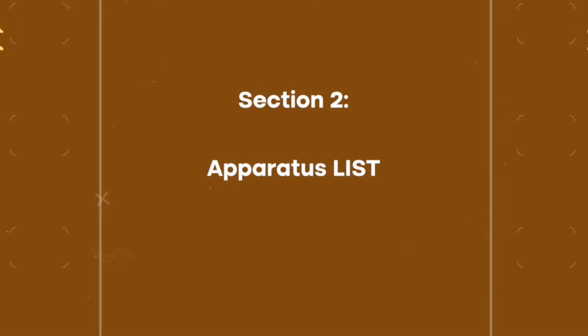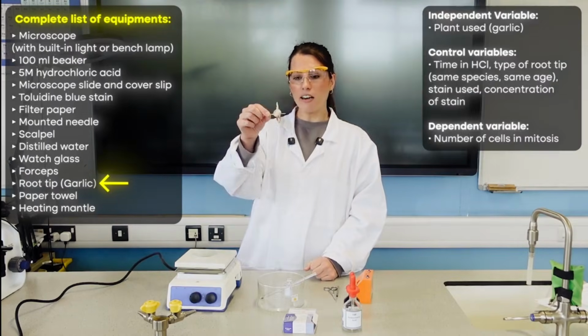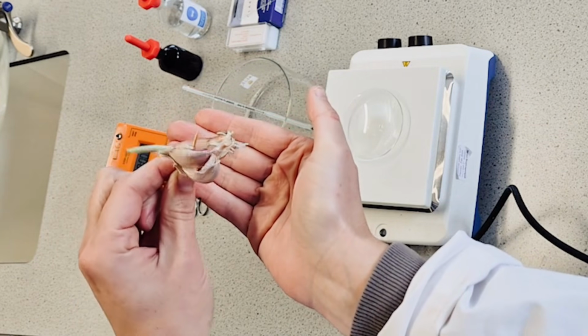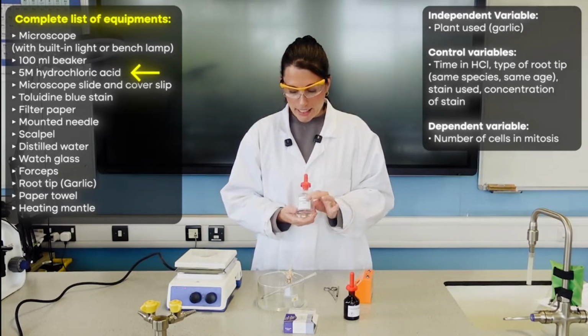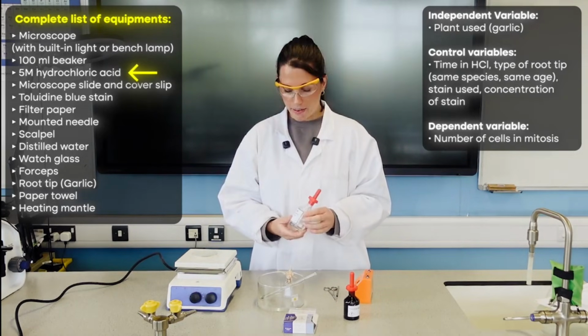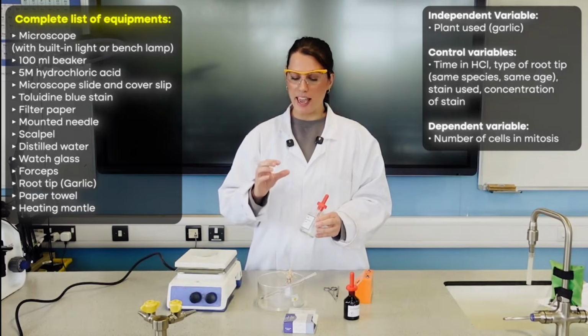But before we jump into all of that, let's have a look at our equipment. So you are going to need garlic. I'm using garlic that's been left to grow, submerged in water, so you do have roots. We need acid, and the role of this acid, which is actually a really common exam question, is that it is going to stop mitosis happening any further, so we get a snapshot.